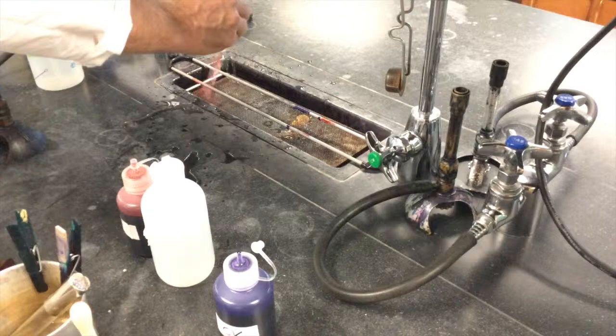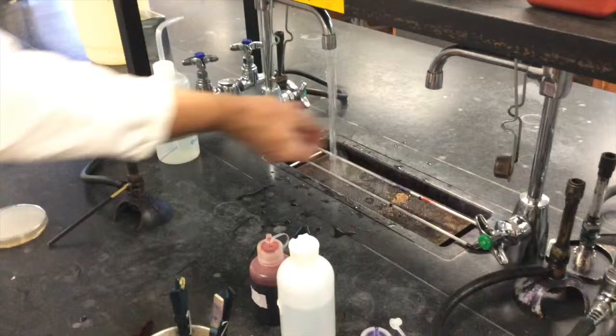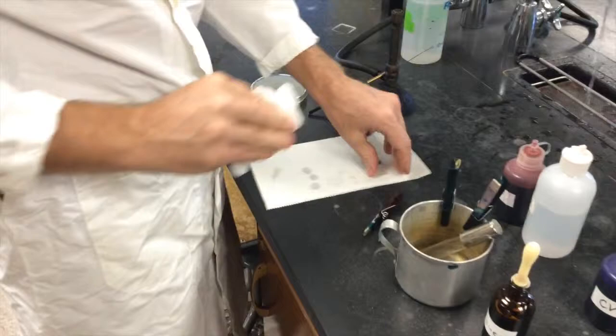Once that's done, you want to very gently wash this. And just briefly, don't wash it too much. You can wash the safranin out of the gram-negative cells. After it's been rinsed gently, you want to put it down on a towel. You can grab yourself Kim wipes if you'd like and pat the surface. No wiping. Wiping will pull your cells off, but you can pat the surface.